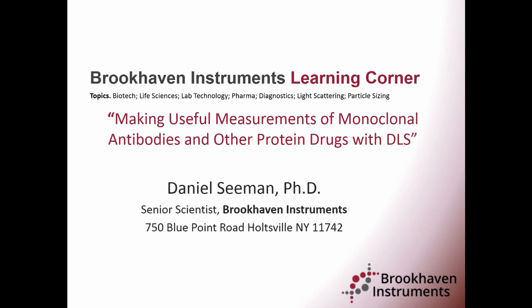And today we're going to be talking about dynamic light scattering, and more specifically, how we could use DLS in order to improve the quality of otherwise difficult measurements, including biological samples such as proteins and biopolymers.